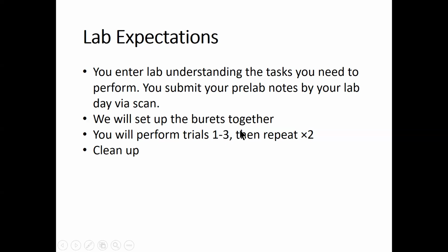You'll need burettes to measure out the quantities for the trials. And you'll do a repetition to make sure that your data is consistent. And then for this portion of the experiment, that's it. Then we'll clean up, and whatever time is remaining, you can go ahead and start the analysis for your lab report. Get those orders and the finished rate law.